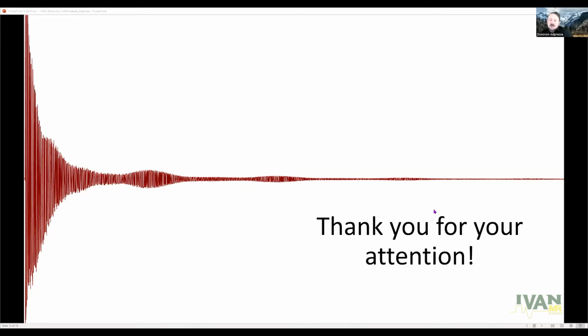I'm sorry, can you say the very last sentence? You can use it as implicit. So the most obvious use of NMR data is explicit constraints, which are distance constraints and torsion constraints. And other types of NMR data can be used as a validation of your final structure, which you demonstrated really nicely with the HDX data. What else do you think could be used for such an approach?